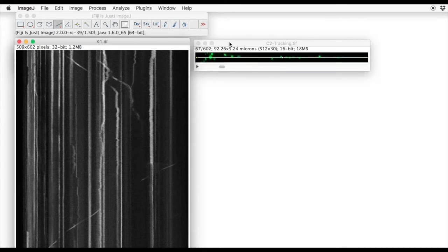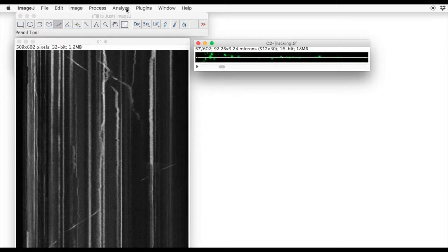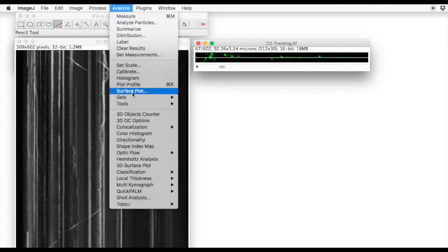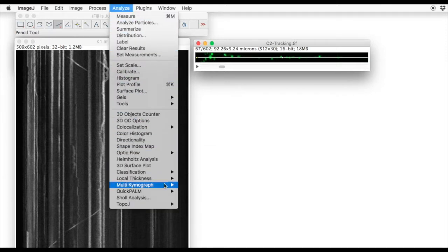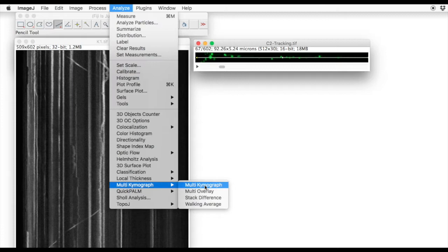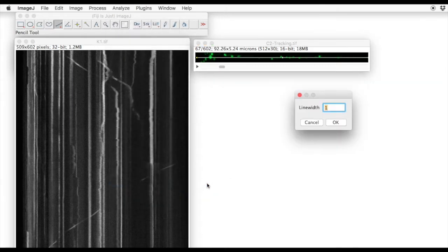Repeat the process for the second channel. Analyze, Multi Kymogram, Multi Kymogram, 29 pixels line width.